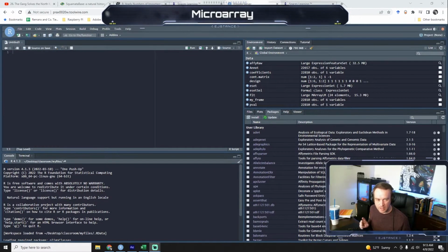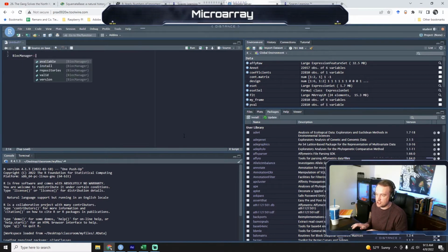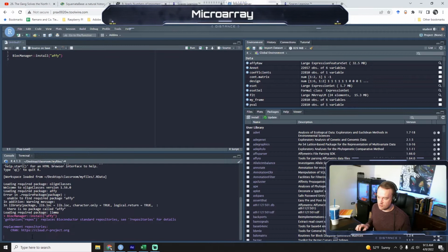Hey guys, I'm making a quick edit to this video. If you look at your packages over here, you'll notice that Affy's not installed, even though in the video it calls for loading the library Affy. So you're going to have to install it real quick. BiocManager install Affy is the command. You run that and it's going to start the install. It might take a few seconds.